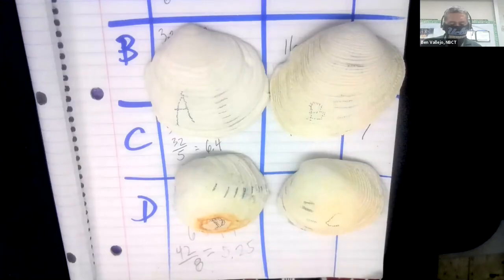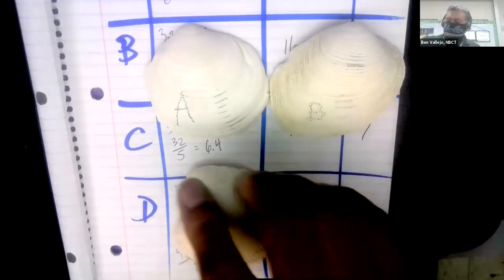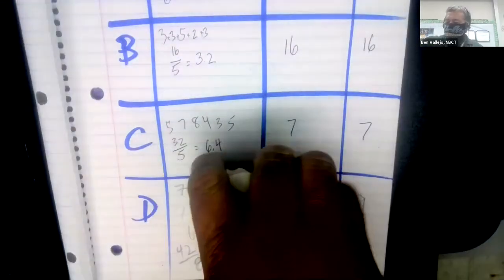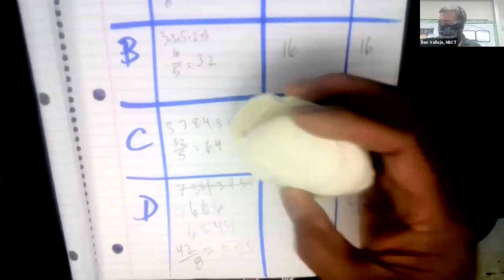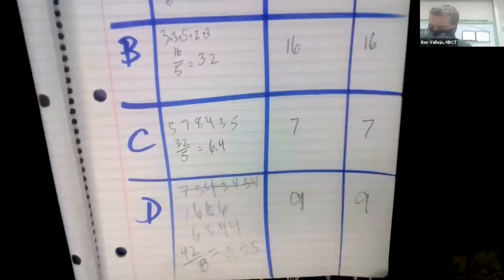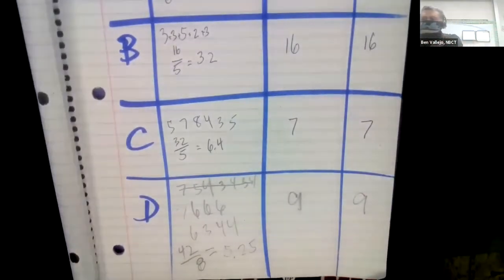And so, let's see. Okay, so I don't know if you knew that already, that the age of a clam can be figured out by counting the rings. But that is a pretty cool feature. So let's show you your table in case you're writing that down.